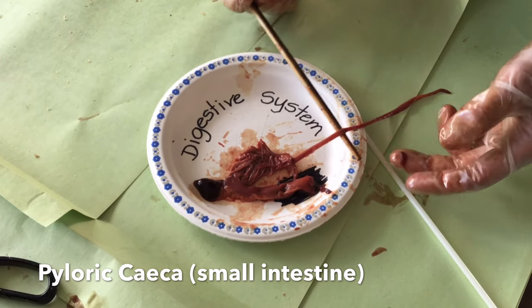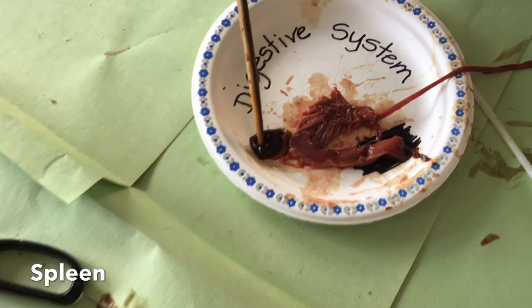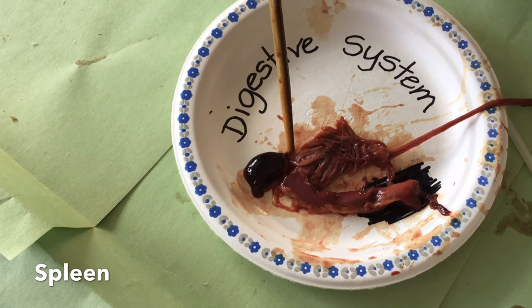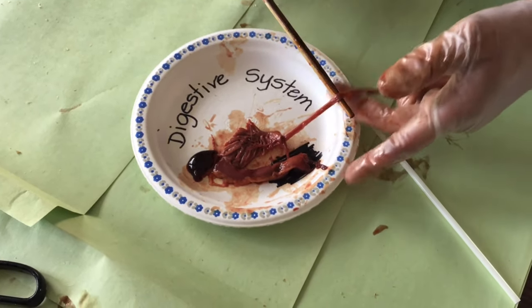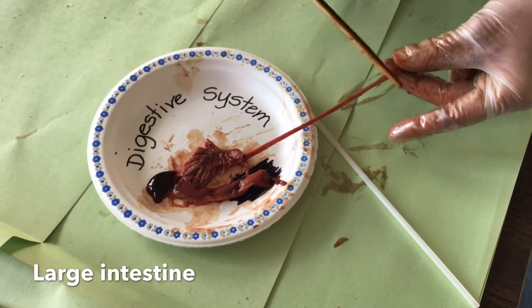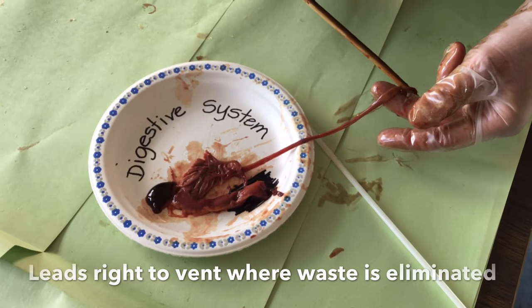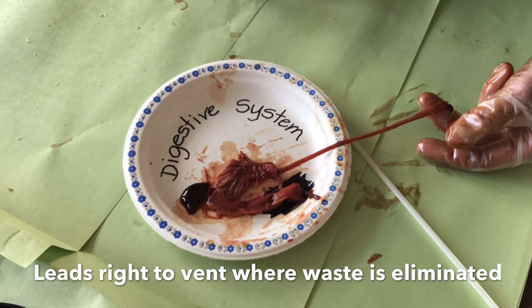Next is the spleen. And the spleen, as you can see, is very dark, and it is a storehouse of blood, of extra blood cells. And now the large intestine, quite long, and this leads right down to the vent, and this is how waste is eliminated from digestion for the salmon, just like how it is for us.